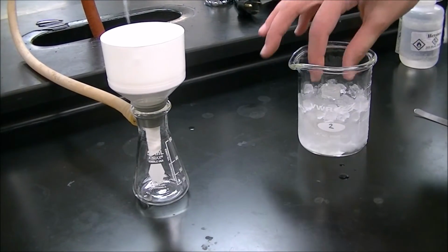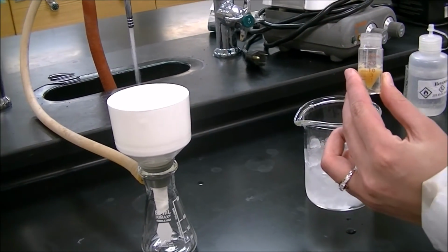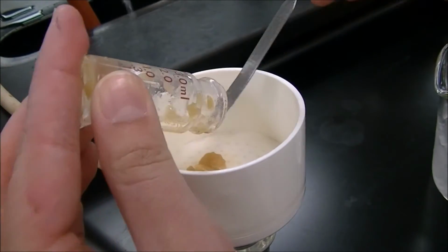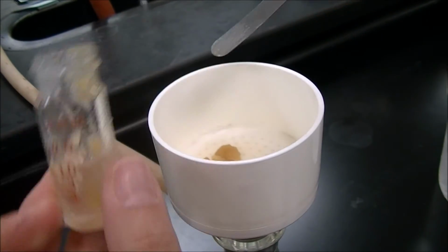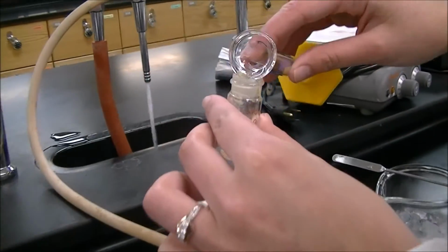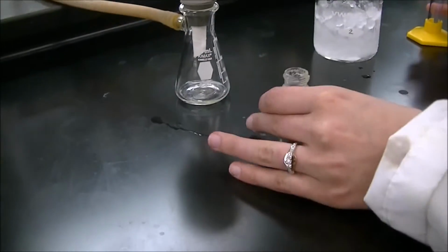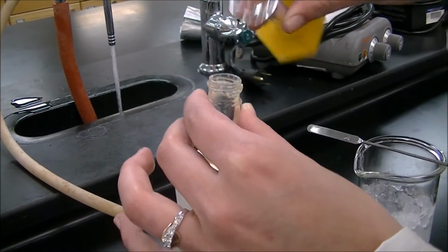The solution in your conical vial should have crystallized by now. To add it to the filter apparatus, you're going to need to scrape it onto the filter paper. Rinse the empty conical vial with 1/2 milliliter of hexane and add it to the filter. Rinse the conical vial with hexane 2 more times.